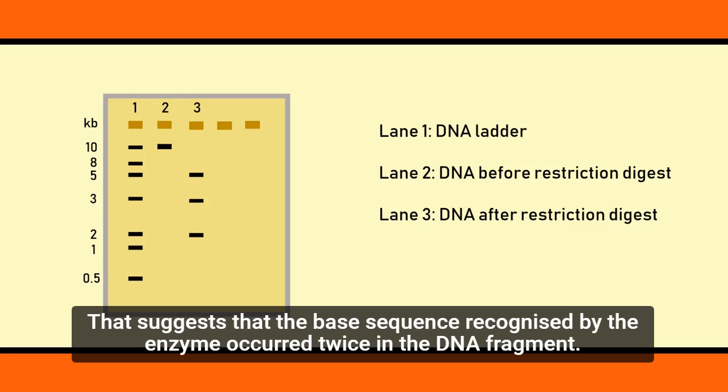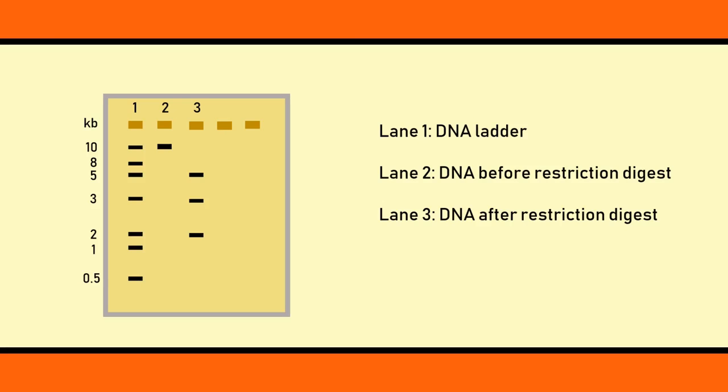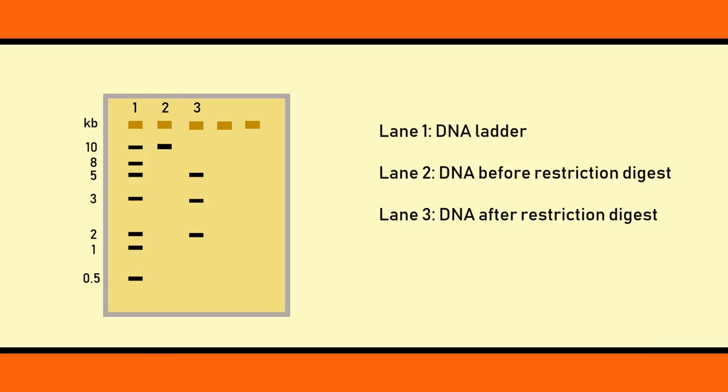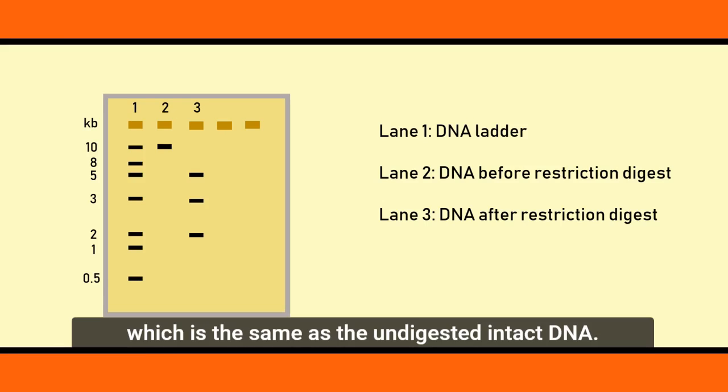That suggests that the base sequence recognized by the enzyme occurred twice in the DNA fragment. Notice the approximate length of the 3 fragments. 5 kilobases, 3 kilobases, and 2 kilobases add up to a total of 10 kilobases, which is the same as the undigested intact DNA.